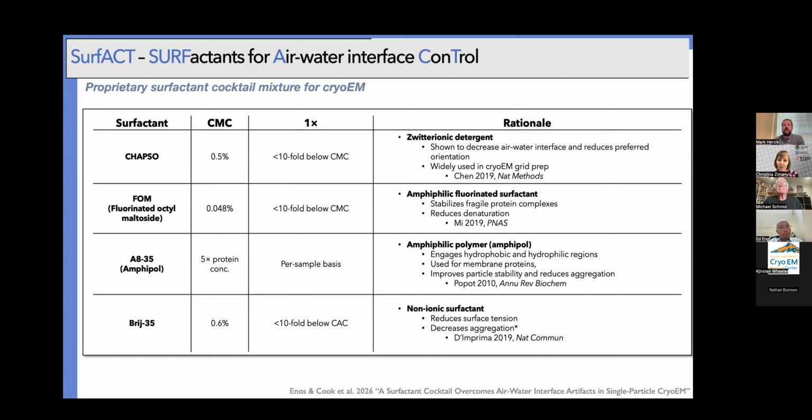So that way you can basically screen. And so we're working right now on developing the dropouts in different working concentrations based both on different physical chemical properties, but also based on what the literature has shown us.